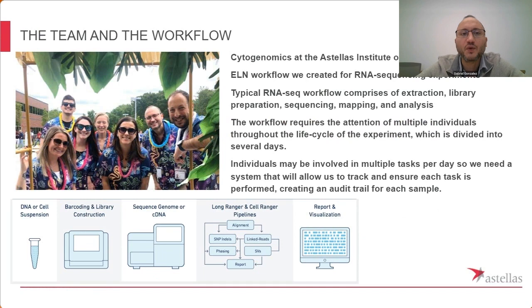So here, I just want to quickly present basically the team and the workflow that we have. I am in the team called cytogenomics at the Astellas Institute of Regenerative Medicine. And in the workflows that we are generating, we're mainly using them for RNA sequencing experiments.